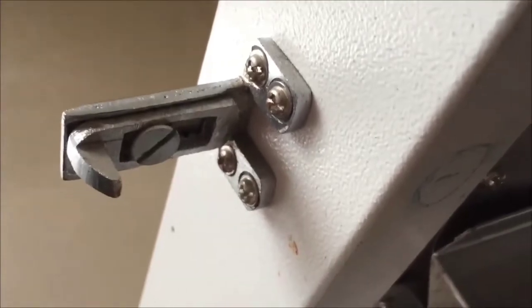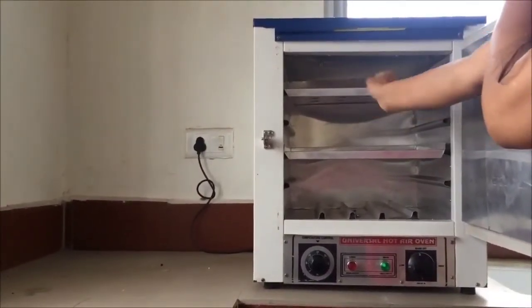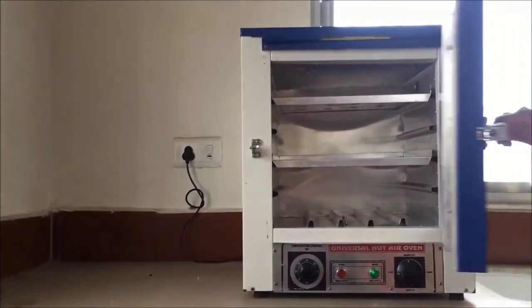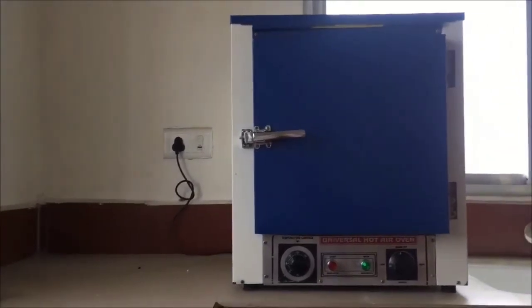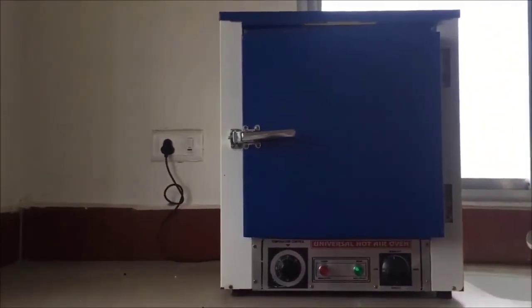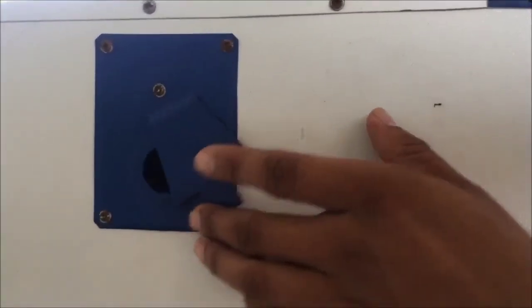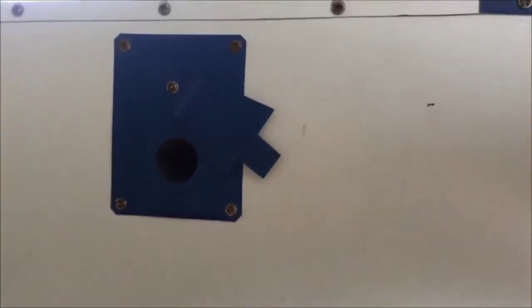This is a special knob to open and close the door — it is unidirectional. Let's place the tray back in its original position. Now, at the outside of the hot air oven, there are two vents — one on the left side and one on the right side. These vents can be opened or closed.